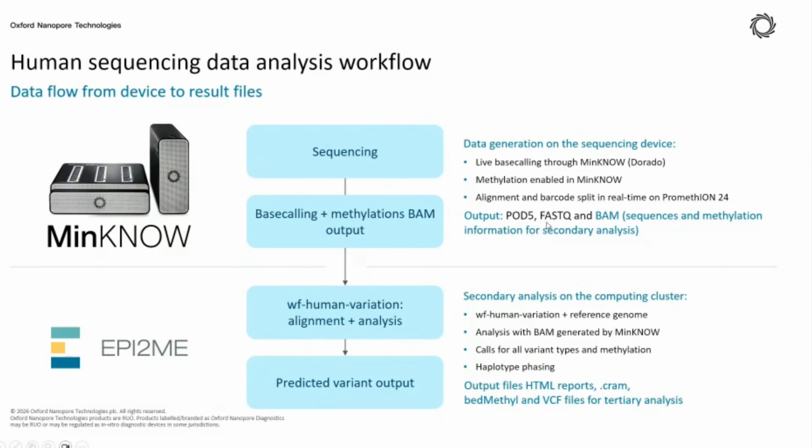And then once the POD5 file is available, we can do the base calling again if we prefer to use more updated models, to obtain our sequence data. And then FastQ can also be obtained.